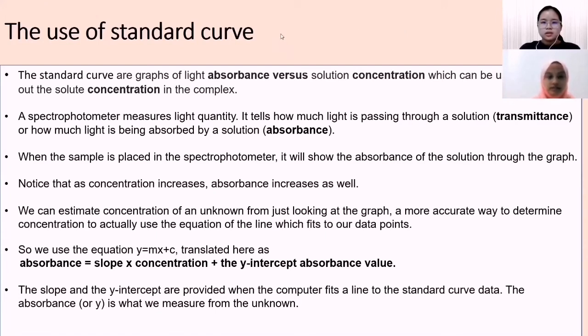Okay, so the next is the use of the standard curve. The standard curves are graphs of light absorbance versus solution concentration, which can be used to figure out the solute concentration in the complex.